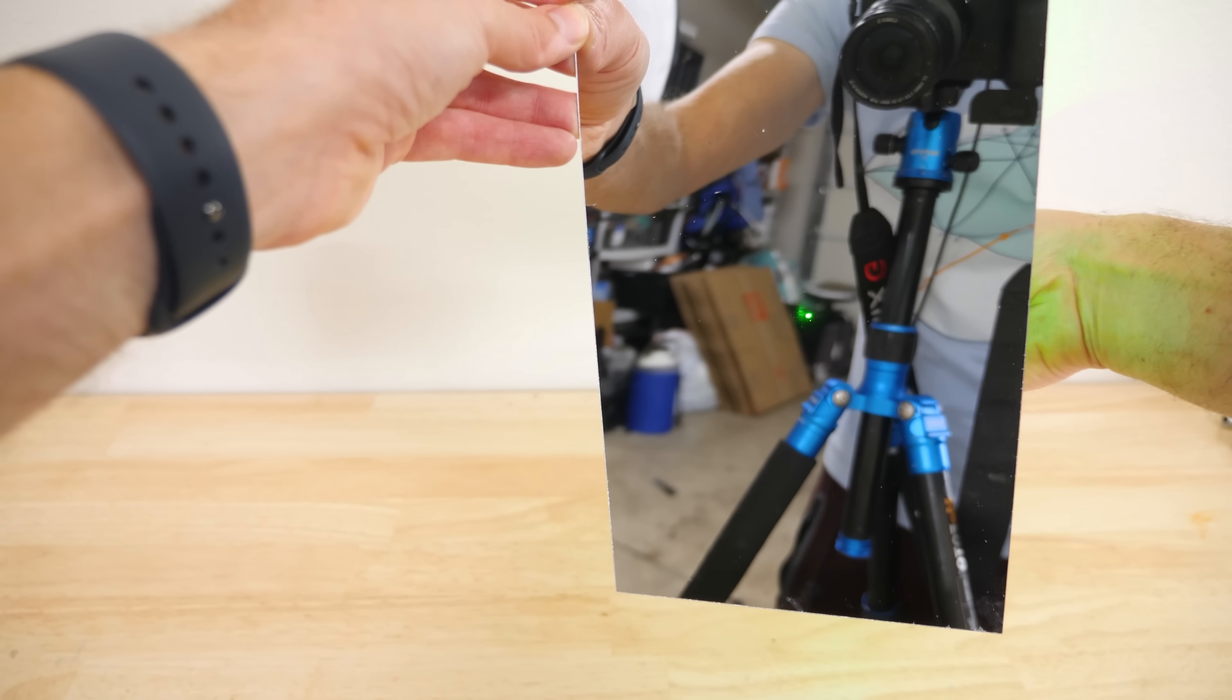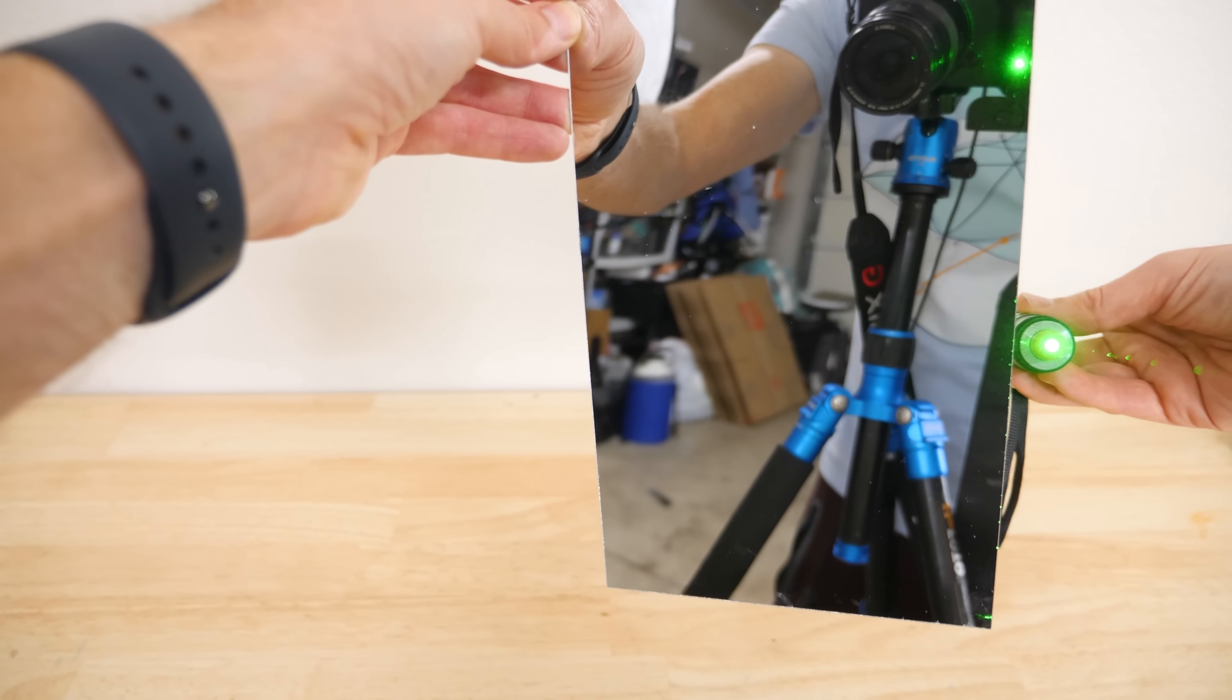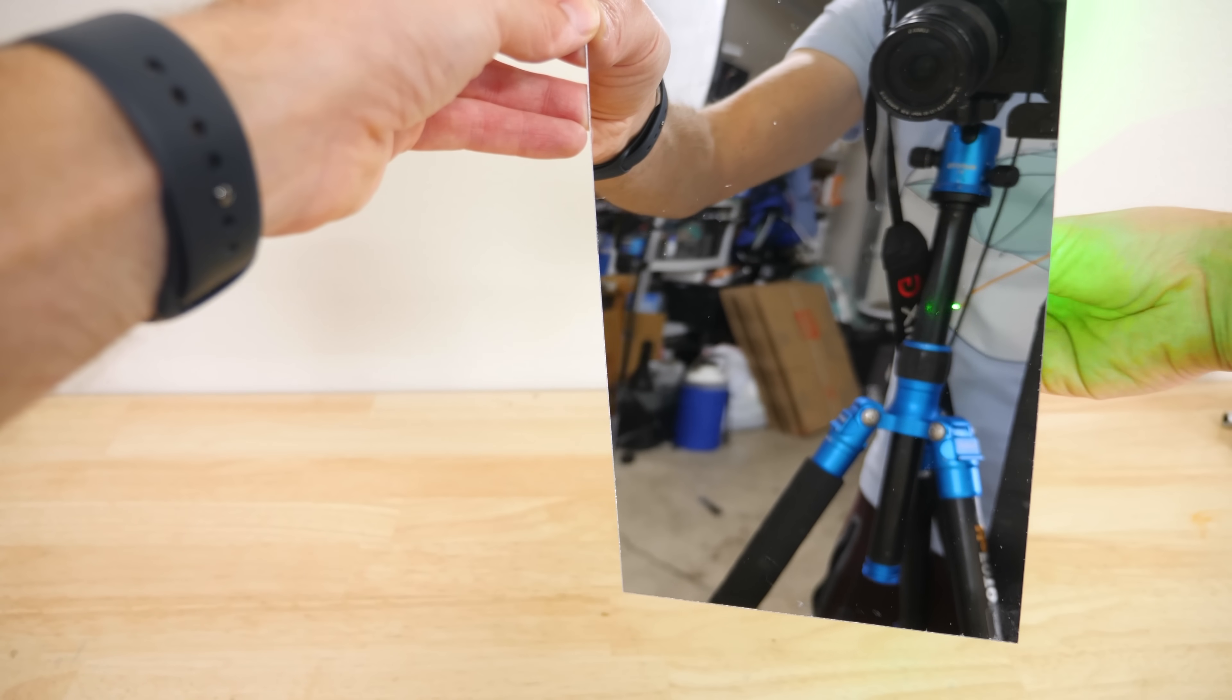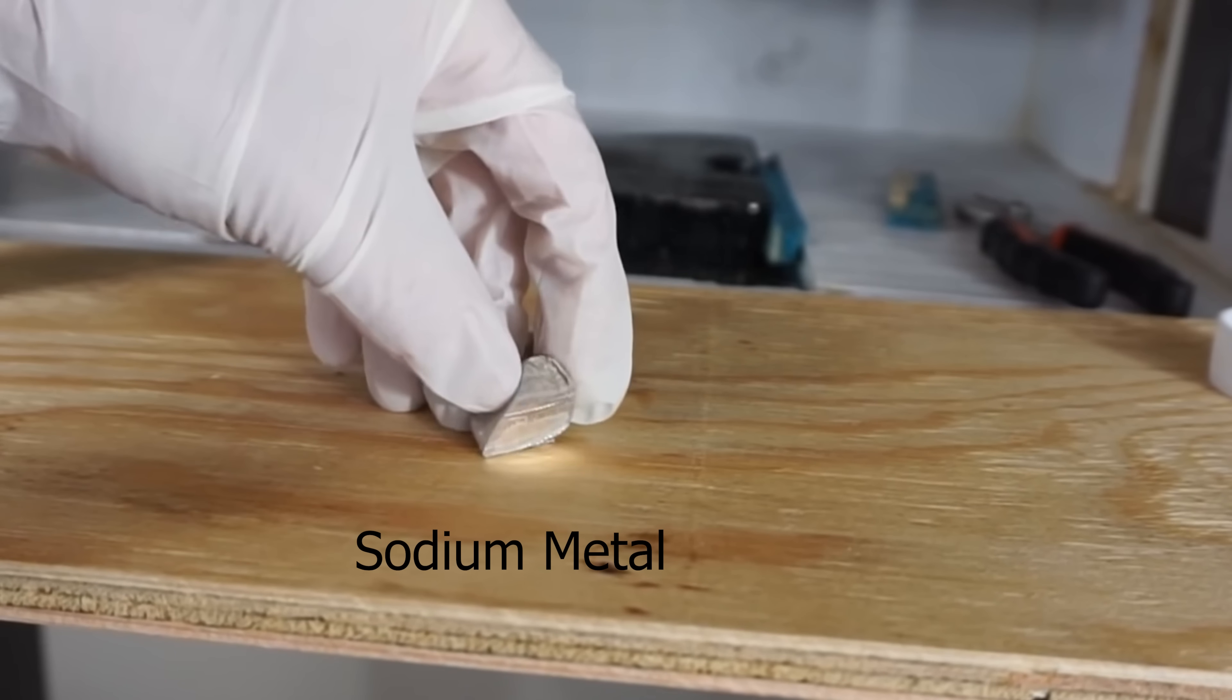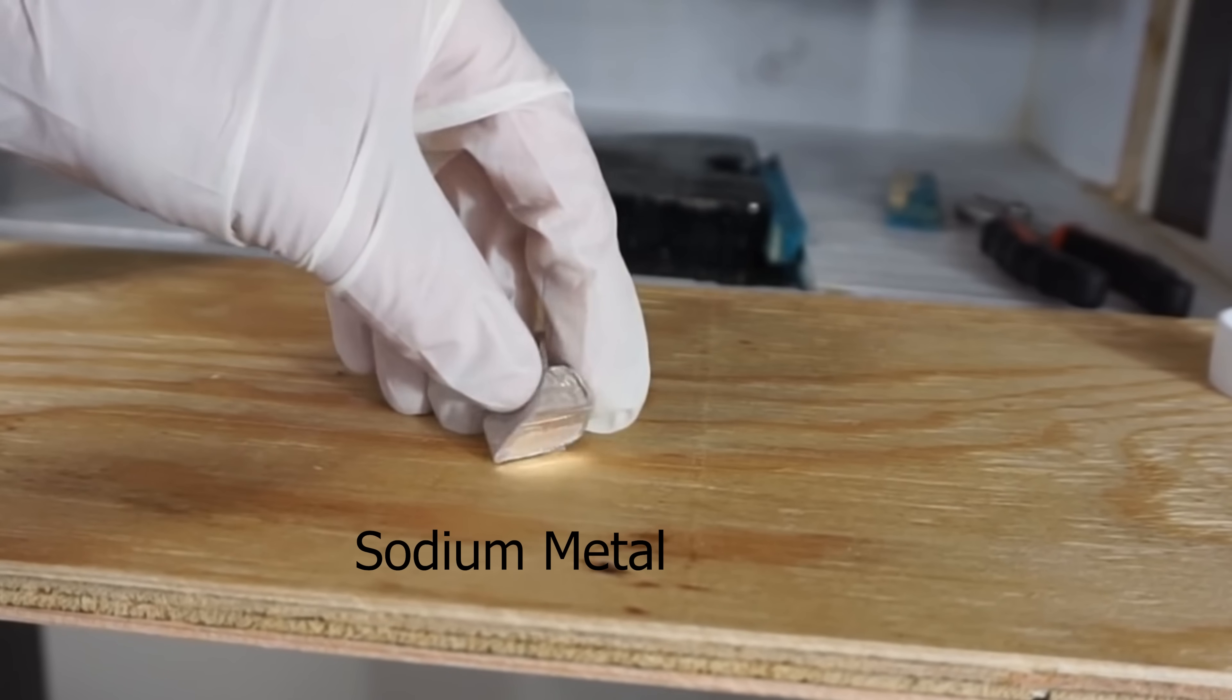Hey everyone, today I'm going to be showing you transparent metal. I've done a lot of experiments with sodium in the past, but we've usually focused on it exploding when you put it in water.